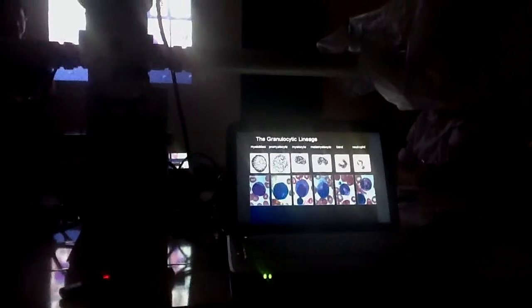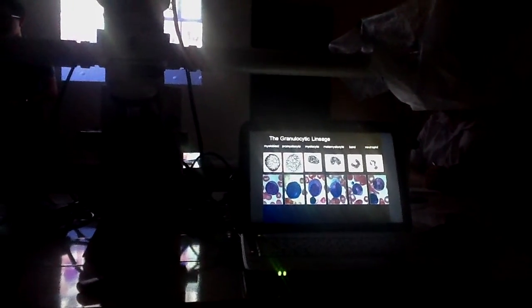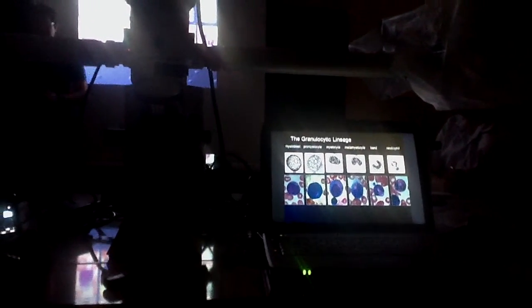You need to really know what to look for in your slides, especially for those who are taking histology for the first time. Okay na yung may mga medtex, may subject na nakasugat natin na histology in their college preparatory course. Now, for those who will be encountering the things that we will be looking under the microscope, it will be beneficial if we will start our laboratory sessions with the slide discussion.